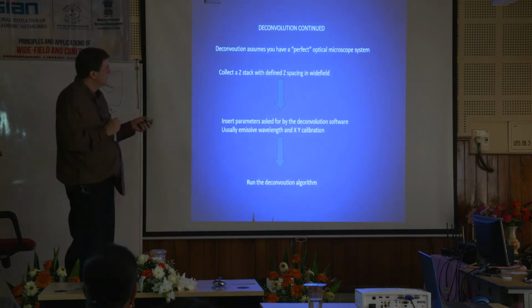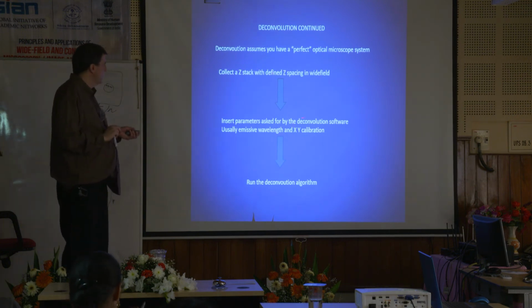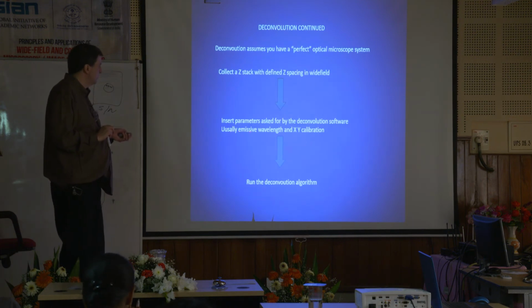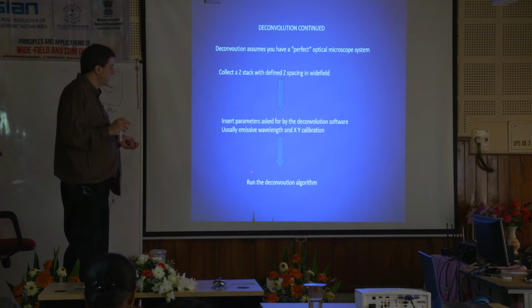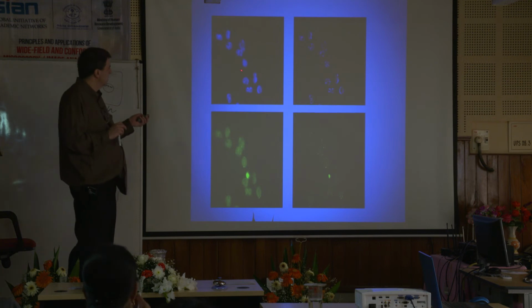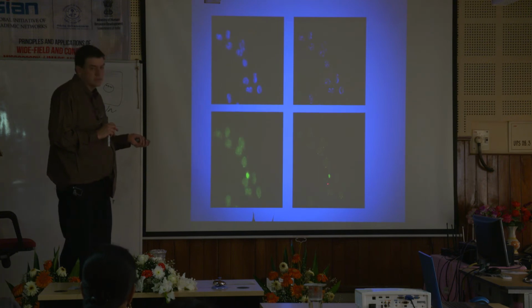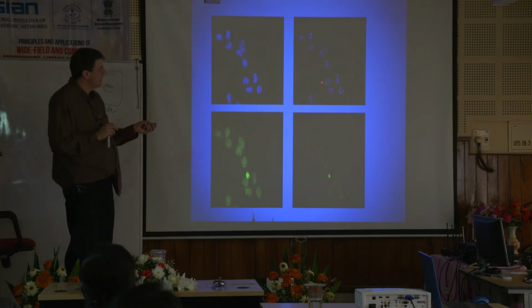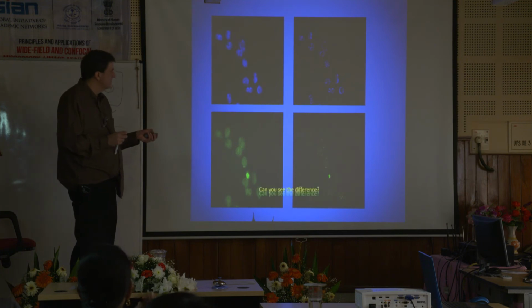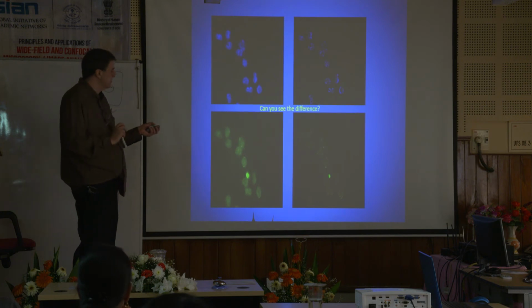Deconvolution assumes you have a perfect optical microscope system. You collect a Z-stack like we've been talking about. Remember Z-stack, moving through Z, taking the pictures, getting a deck of cards. Insert the parameters in the software. Usually one of them is the emissive wavelength and an XY calibration, and then you run it into the deconvolution algorithm, and woo, you go from this to something like this. Okay, so definitely more confocal-like, and it definitely cleans up the images. Okay, you can see the difference. It's pretty obvious. It's pretty cool when you actually run it and you watch it happen. It's like, wow, that's pretty cool.